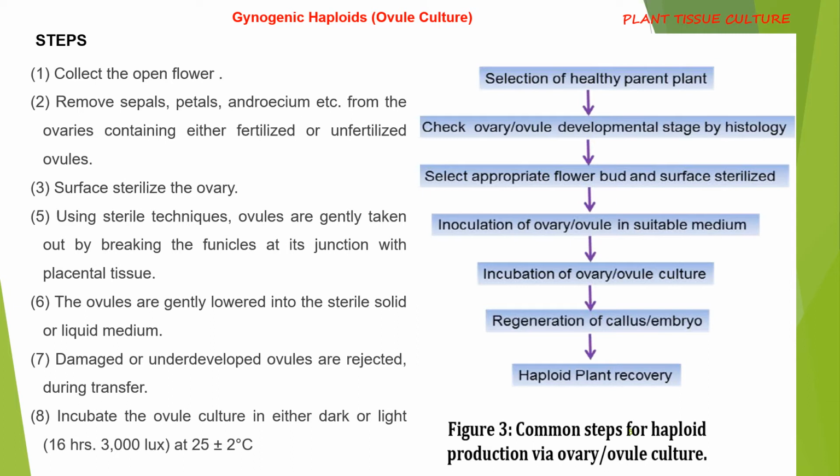One of the techniques of removing ovules into the inoculation media is known as ovule perforation. In this technique, a small hole is made in each ovule without damaging the egg cell or the embryo inside it. It is then inoculated into the culture media.